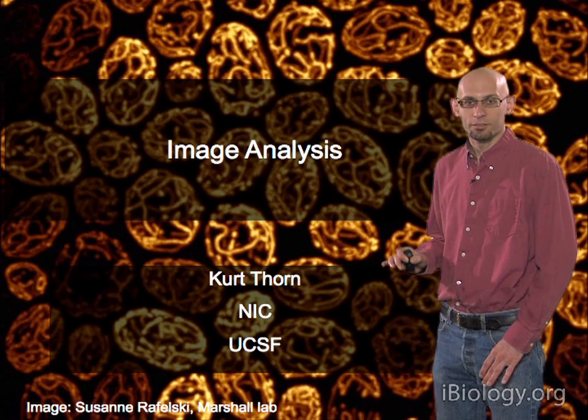So if we put it down here, we'd have 1s that overlap these 0s, and so we'd set this pixel to 0. Go here, we have 1s that would overlap with 0s. We set that pixel to 0. But if we put the structuring element here, you can see that 3 by 3 box of 1s would all match 1s in the image, and so we'd keep this pixel as 1. So if we do this erosion, we get an image that now just has 2 pixels in it that are set to 1. These are just the 2 pixels that are fully inside the body of this object. So erosion is a good way to get rid of stray pixels, little things that stick out from objects. And then its counterpart is called dilation.